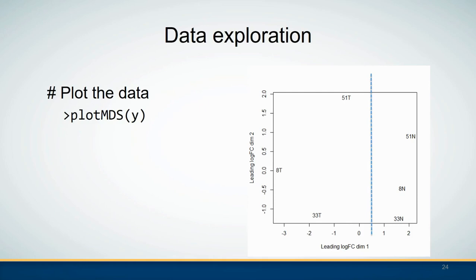EdgeR provides some basic data exploration tools. The plotMDS() function produces a plot in which distances between samples correspond to the leading biological coefficient of variation between those samples. In this plot you may find that dimension one separates the tumor from the normal samples, while dimension two corresponds to the patient number, representing the paired nature of the samples. The tumor samples appear to be more heterogeneous than the normal samples.